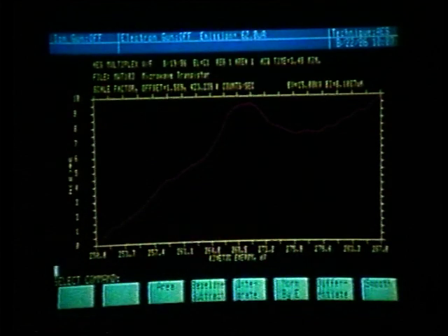For example, on survey scan, we cannot ask for the atomic concentration. Also on a survey scan, we cannot ask for an atomic concentration profile. So those keys will be masked, very similar to the way soft keys number 1 and number 2 are now masked.